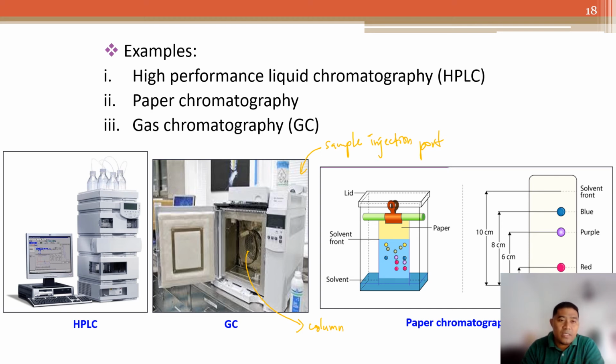Okay, so you can see HPLC dia bentuk petak panjangnya ni. So sebenarnya dalam tu ada kolom. Nah, kolom ni macam ni. Ni GC pun ada kolom. Okay, kolom dia berbentuk gulung, bergulung macam getah tu, tapi dia punya layer tu banyak. So untuk berlaku separation dalam tu. Paper chromatography also same, dikenal sebagai partition chromatography.